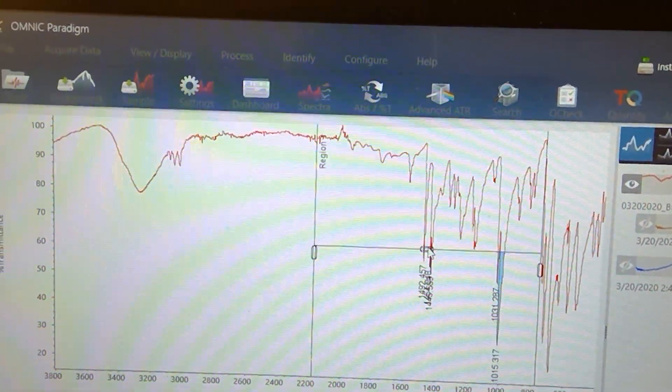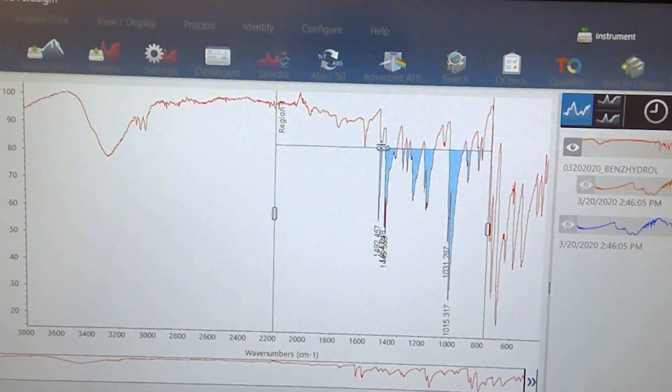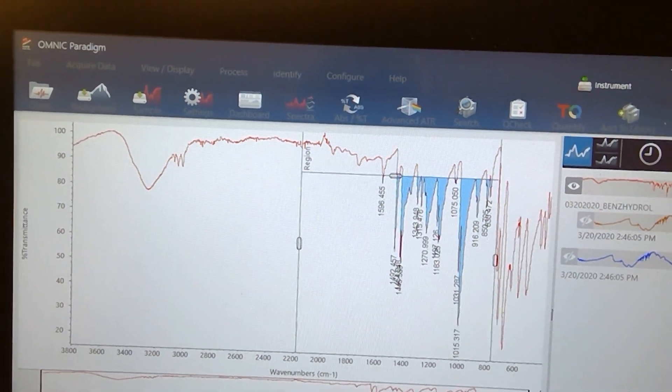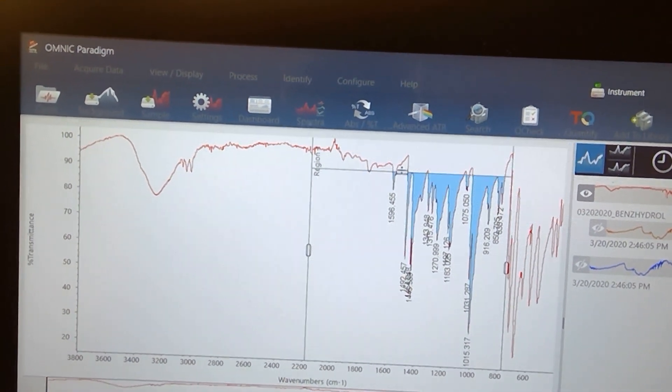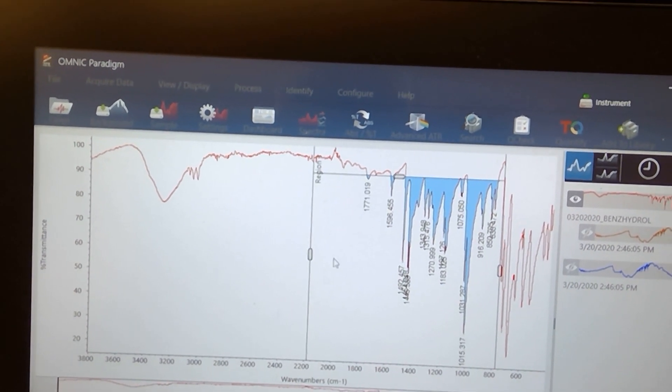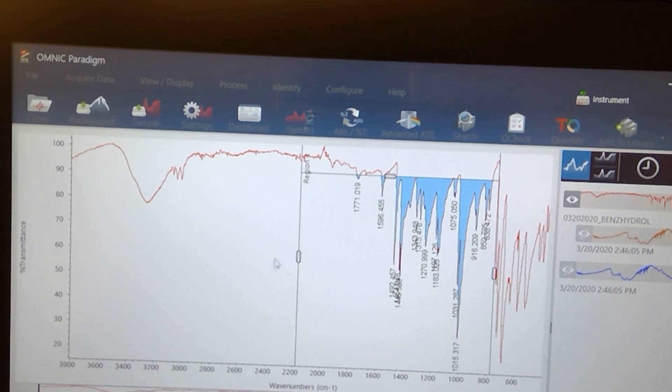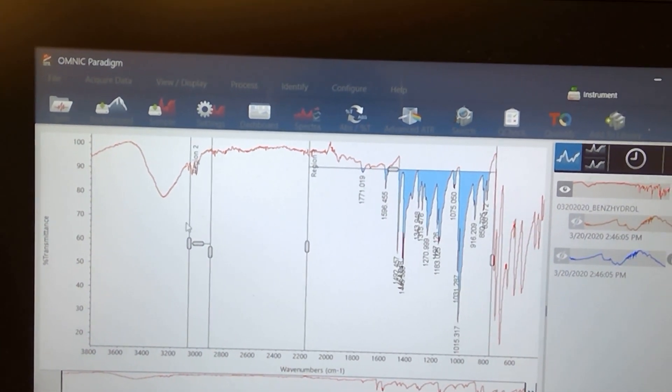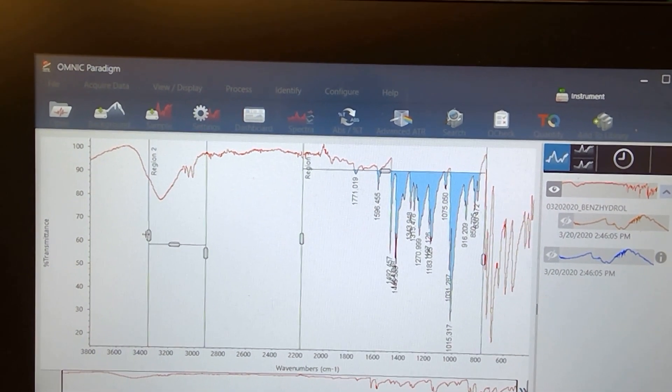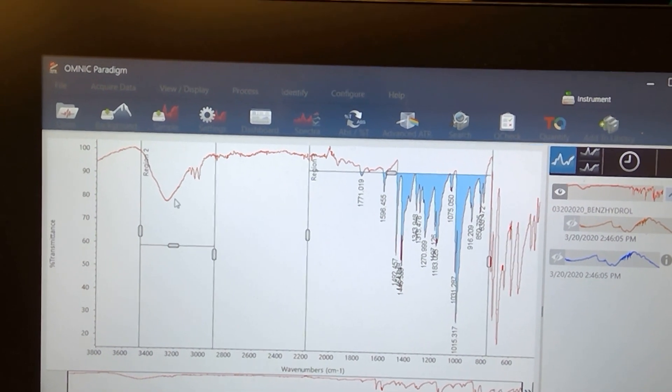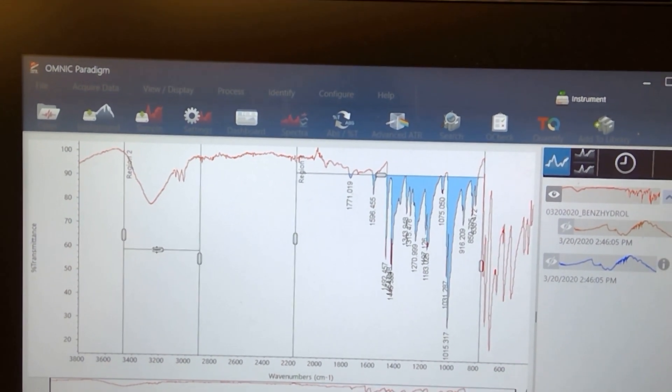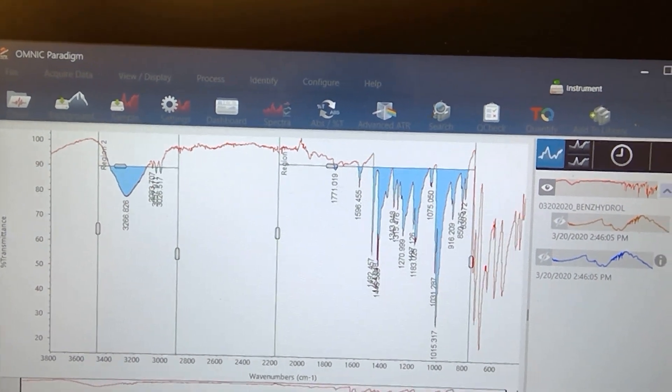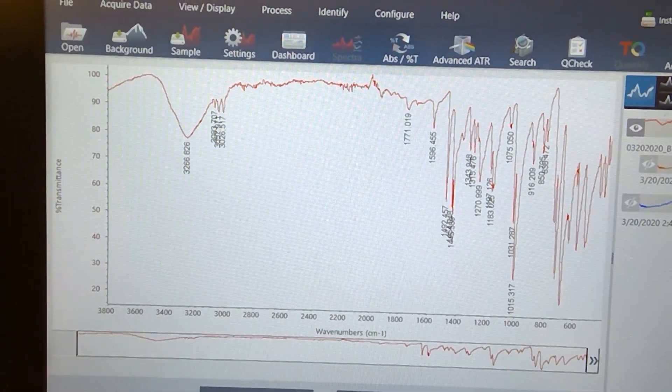Let's go ahead and identify some peaks. The significant situation here is that we should no longer see a ketone peak. Let me double check and see what we have there. That looks like it's a benzene, and I'm going to add a second region just to ensure that we don't have carbonyl. 1771, that looks like it's out of range for a ketone, that'd be too high for a ketone. I'm gonna go ahead and add a region and then we're gonna get some values here for the alcohol, and hopefully those are some hydrogens that are bonding to a benzene ring to the right of this peak. Looks pretty good so far. I'm gonna go ahead and click save, and I will provide you with this infrared on ILEARN.